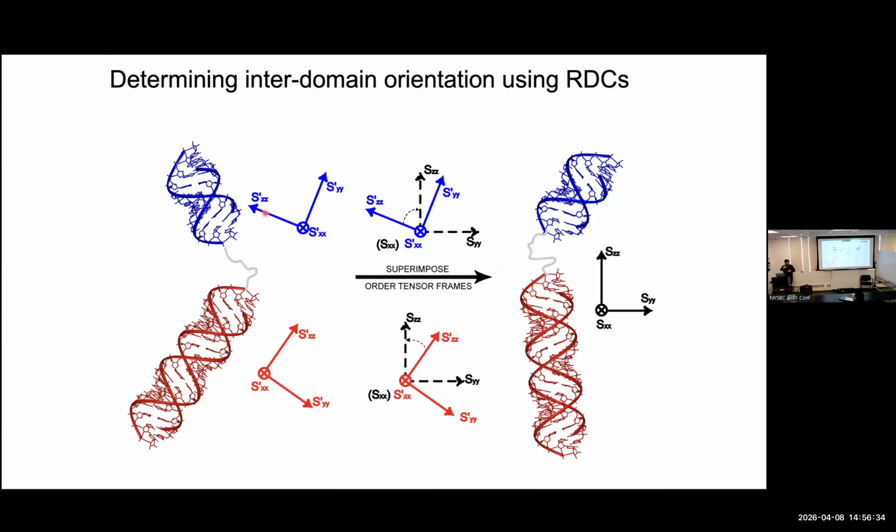Nucleic acids are extended structures with very little protons, and the error that compounds from distance measurements locally creates great uncertainty in the global chain. Whereas RDCs are literally global measurements. They don't care about this. And I can measure them in great abundance, and so therefore it is very constrained.